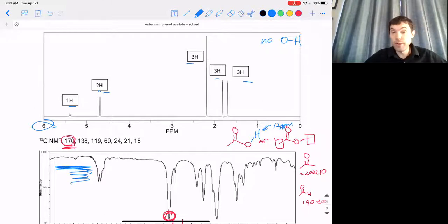And so the combination of those missing peaks, and you want to be careful here because we shouldn't really interpret the absence of peaks, but in this case, those signals as a pair are pretty diagnostic, where I think we should at least operate preliminarily on the assumption that we have an ester here. And that's convenient because then we have 2 groups here that we have to assign as being on the left side or the right side of the ester.